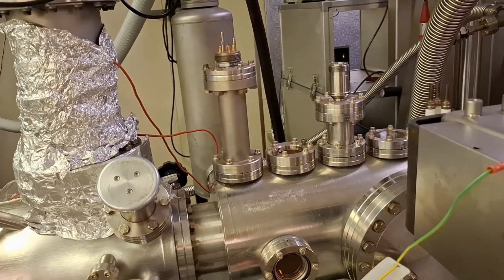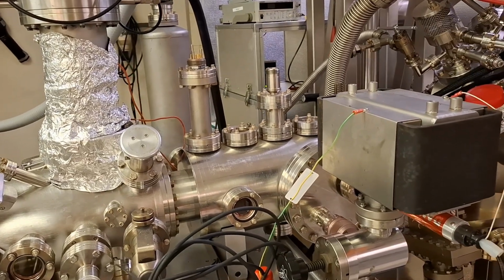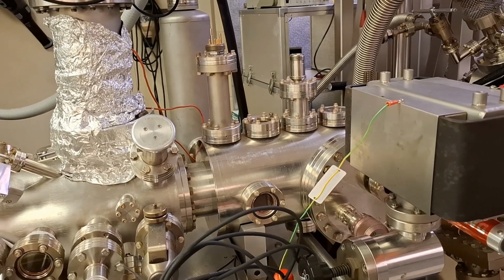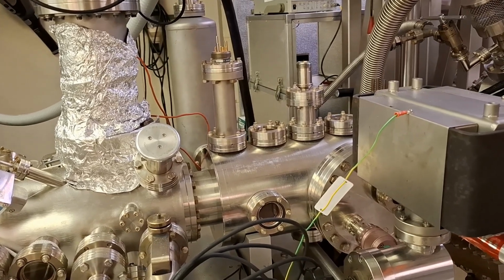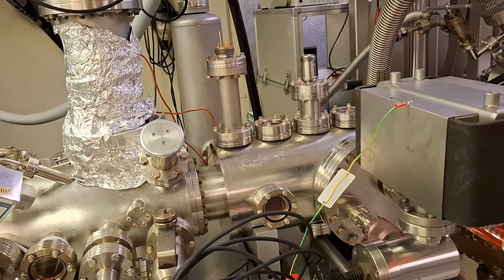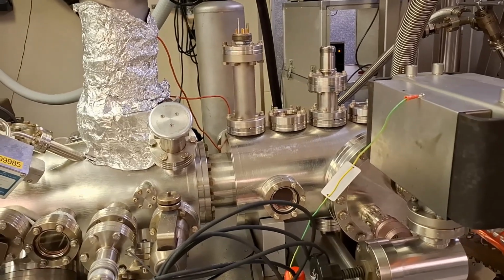Inside the source, there is a lithium-containing material. When a sufficiently high current passes through, the dispenser heats up and lithium is released from the dispenser material. Neutral lithium atoms leave the source and they condense on the single crystal surface, which forms a thin lithium film.